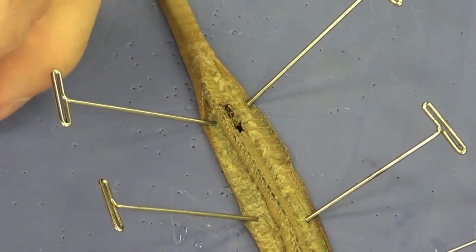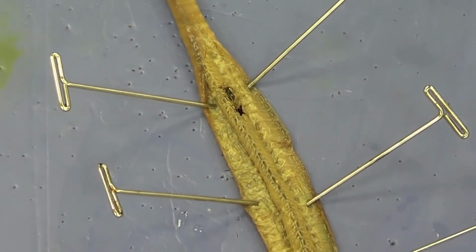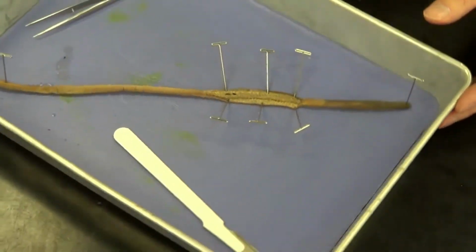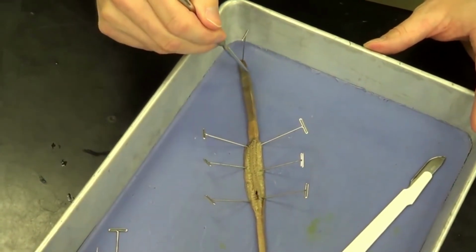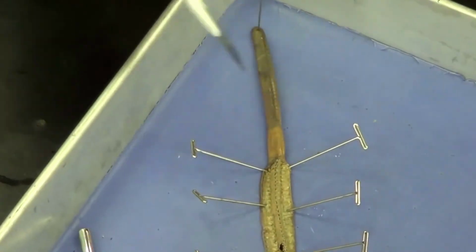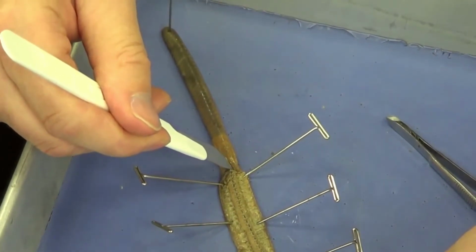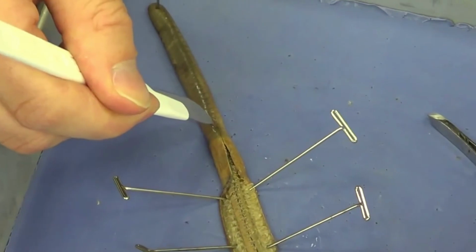Now, I'd like you to practice and proceed all the way down to the anus. After you've gotten there, you've gotten in some practice, then go ahead and turn the earthworm around, and let's begin working towards the anterior aspect of the earthworm. And what you're going to do is just cut right through that clitellum as though it weren't there. So I'm going to go ahead and, again, cutting very shallow, about a half an inch to an inch at a time, I'm going to cut right through that clitellum.